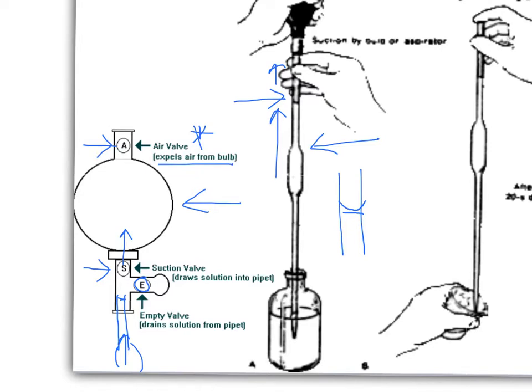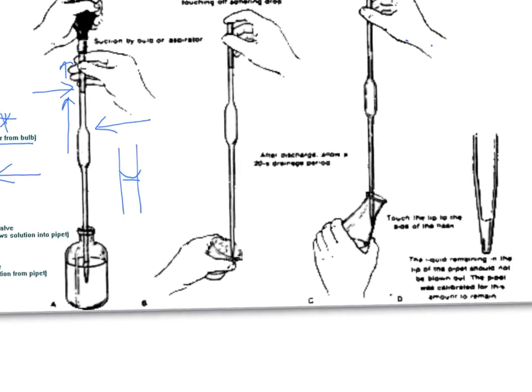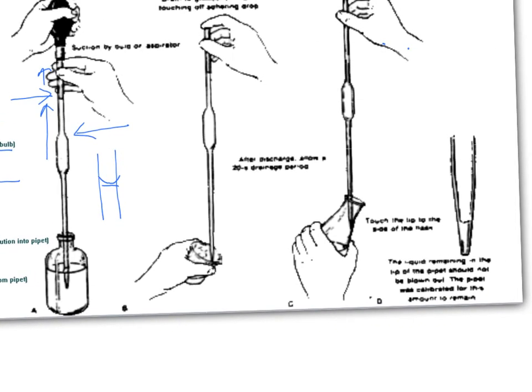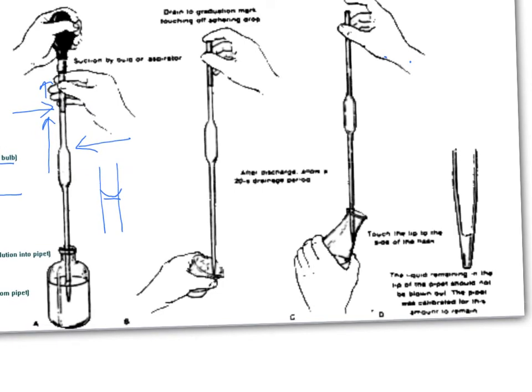Then you're going to take it out of the solution that you're sucking up. You're going to lift the pipette out, press the E button, the expelling one, and take it down to the meniscus. So you're going to press it until it comes down to that meniscus.